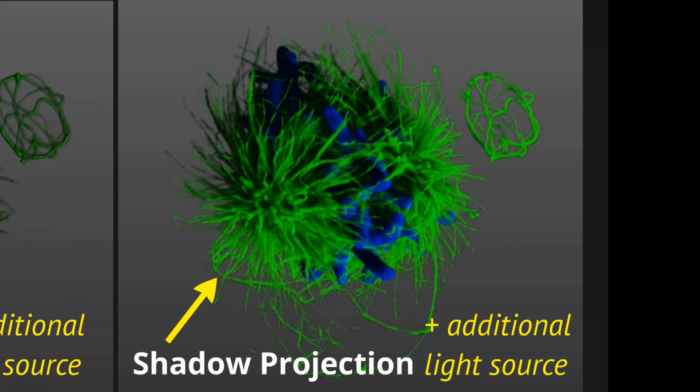Okay, so what it basically does is the same as the last two techniques. We turn the background gray. That is a preference. You can have it whatever color you would like. We do that to help emphasize the edges of the structure. Instead of having it black, we can see edging and shading. We still have that same light source in place, but it actually casts shadows behind those structures. So if a structure is obscuring another structure, the one behind it will appear black. So it even more so gives you that illusion that you're looking at a three-dimensional structure.